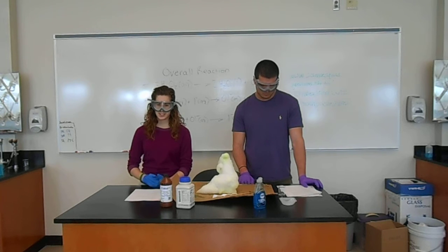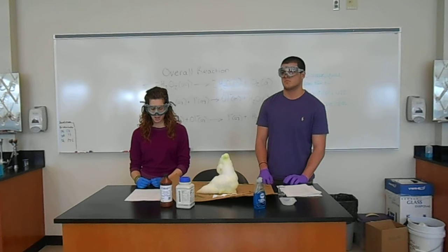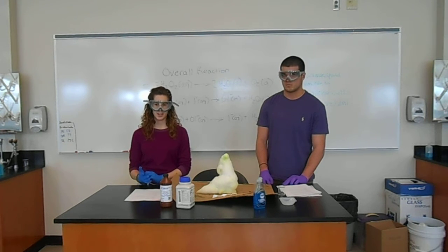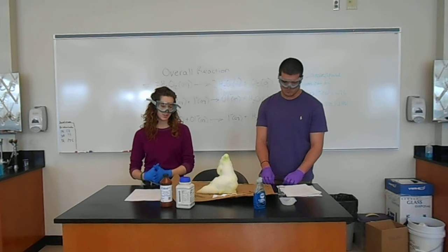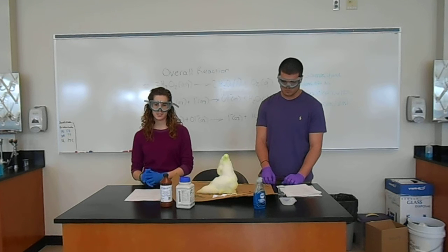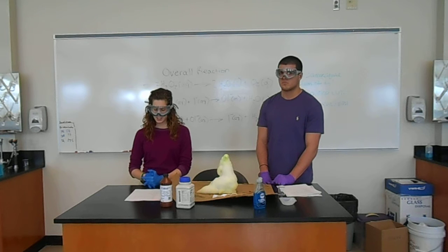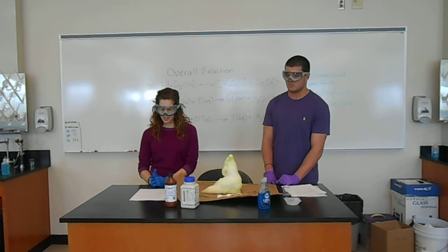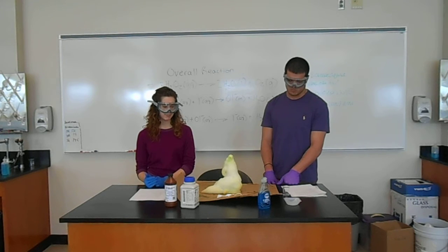This foam is formed by tiny bubbles of oxygen getting trapped in the detergent. The oxygen bubbles were created by the hydrogen peroxide and potassium iodide being combined. The potassium iodide was the catalyst, which is like speeding up the reaction. And the oxygen gas creates the foam when it reacts with the detergent. The hydrogen peroxide undergoes a chemical reaction and is changed into water and oxygen.